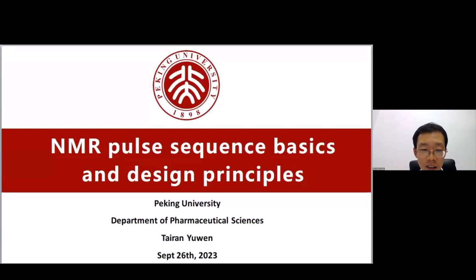The topic of my talk is NMR pulse sequence basics and design principles. I'll just introduce the most basic stuff about NMR sequences for those students who are interested in how NMR experiments work and how to write new pulse sequences.